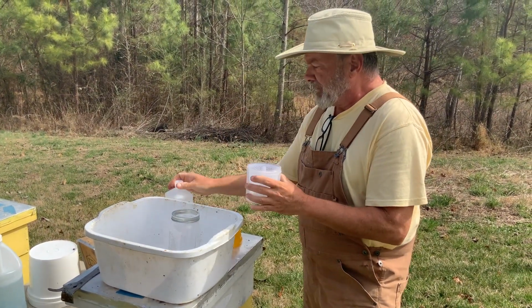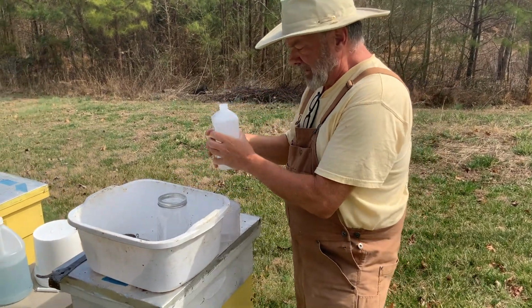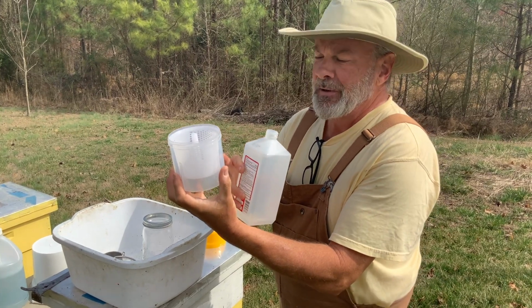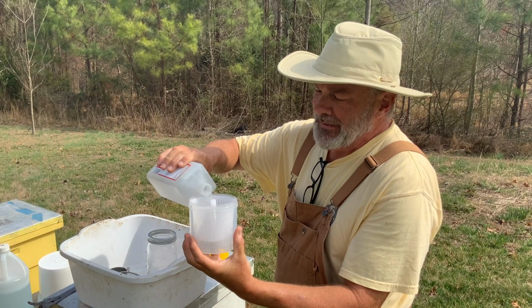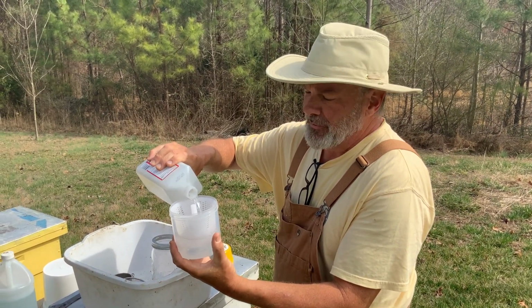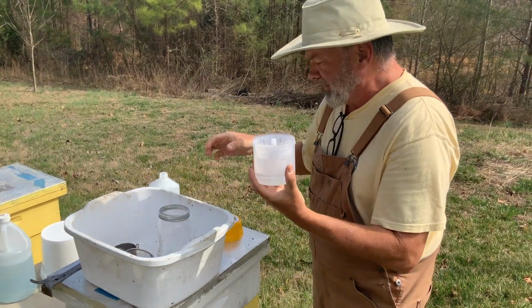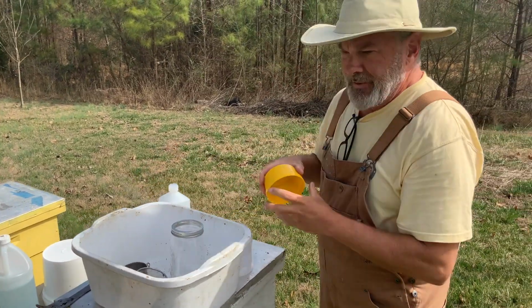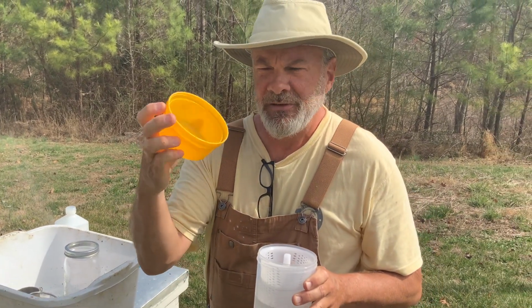To start, we're going to fill the container with the solution. The general recommended method is to only fill it up partially, put our bees in, and then add more liquid. But I've not found having enough liquid in there from the beginning to be harmful at all. So I go ahead and have enough to make sure that the bees are completely immersed in the liquid when we take our sample.